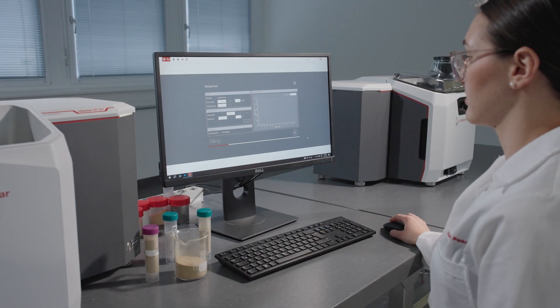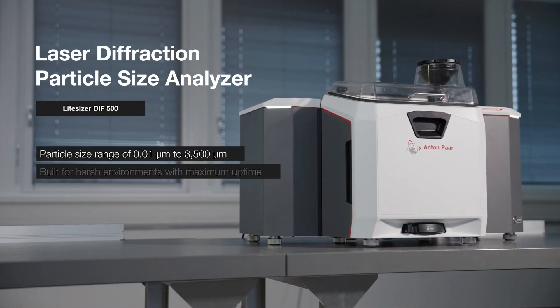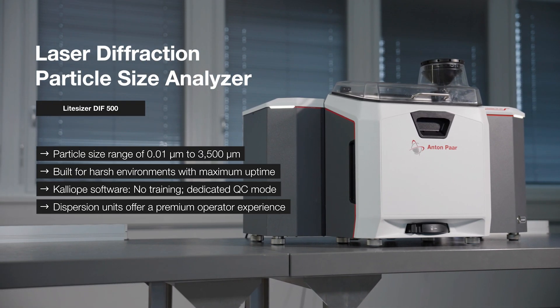LightSizer DIF — from first to best. Delivering a premium operator experience even in harsh environments.